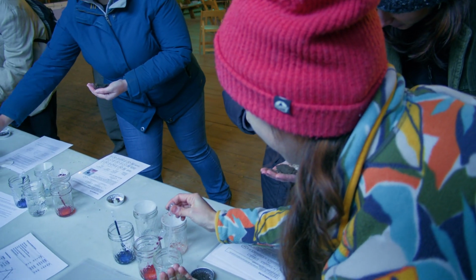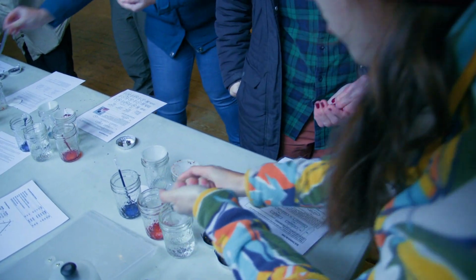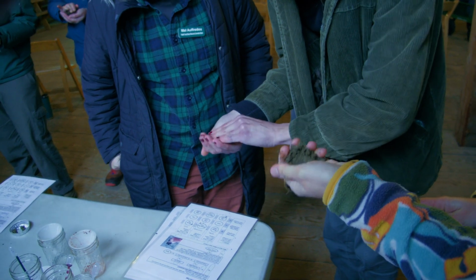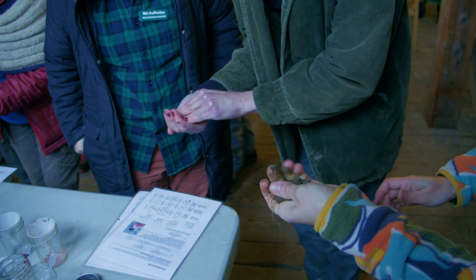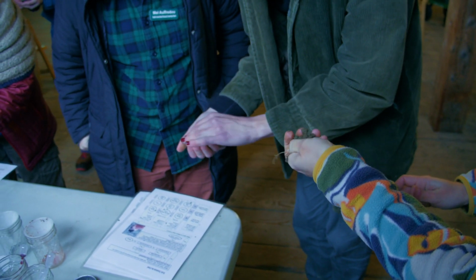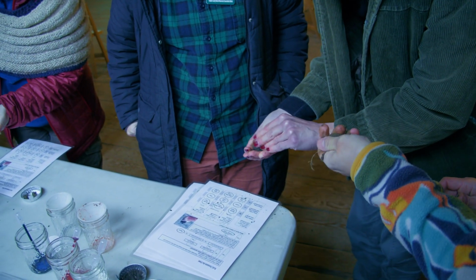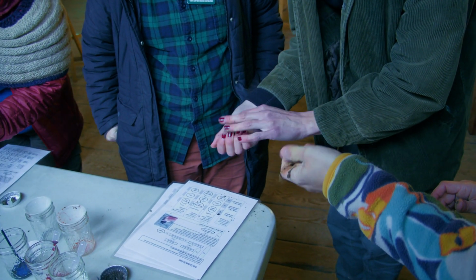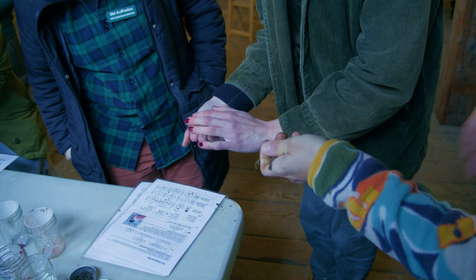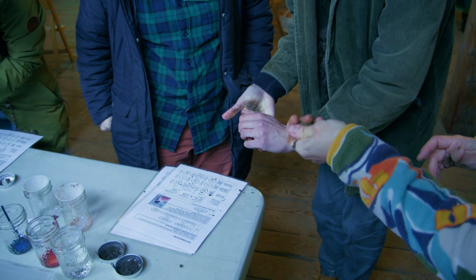The way I like to do that is kind of just grab a bunch and mush it around with one hand. Add water if you feel like it's too dry. It kind of gets messy. Sorry, everyone who works in this barn. But you can feel it become a little bit more, it almost becomes like foam feeling, at least in certain soil textures, and that's how I know that I've gotten it moist enough.